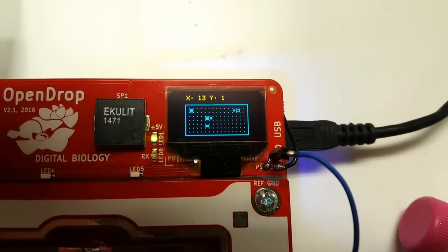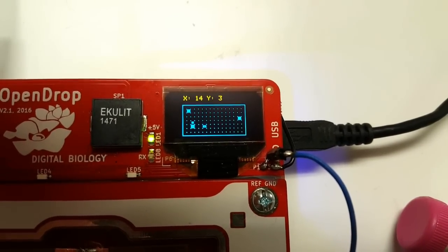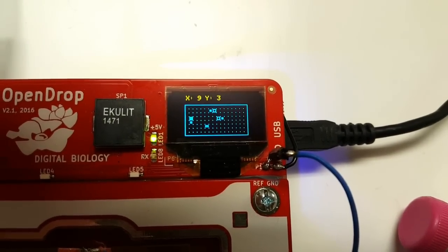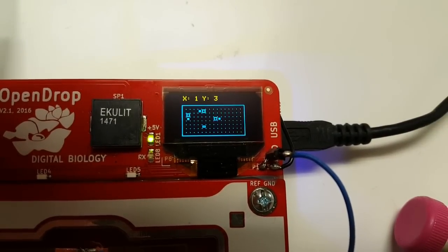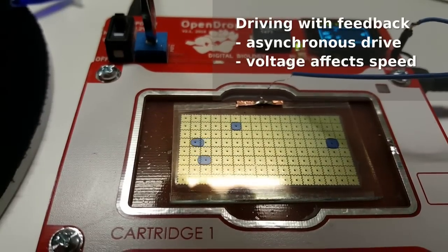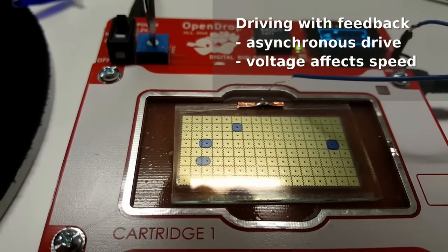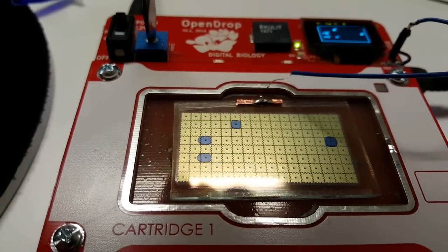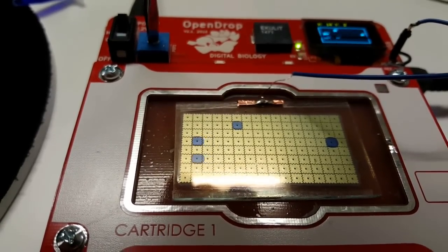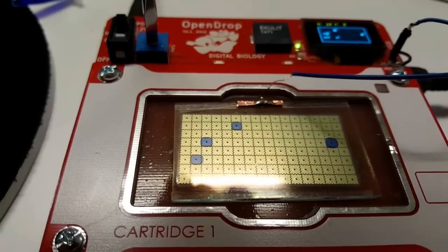The feedback reading and the active electrode is also represented on the display. The driving of each droplet is also done by feedback, which means that only when the droplet reaches its position, the new electrode is activated. This means the drive of the electrode is asynchronous.